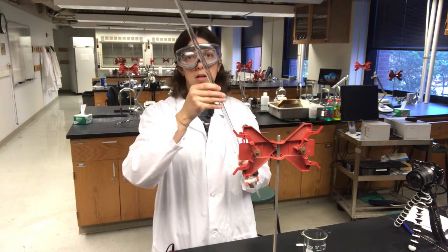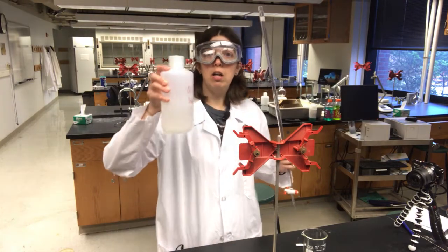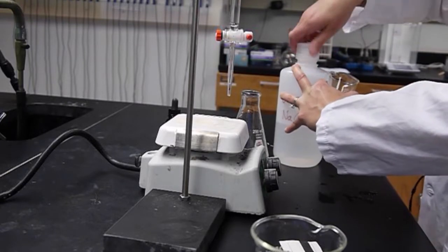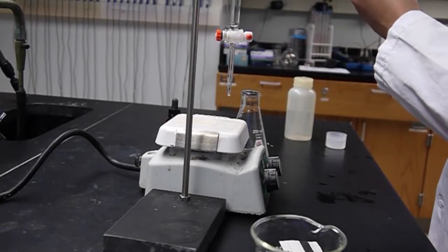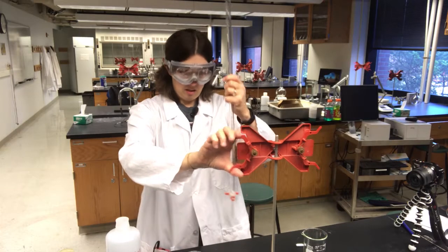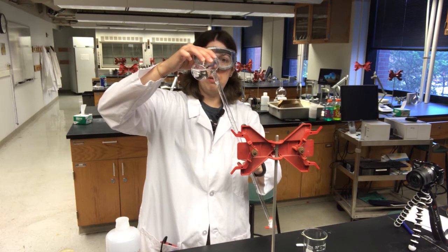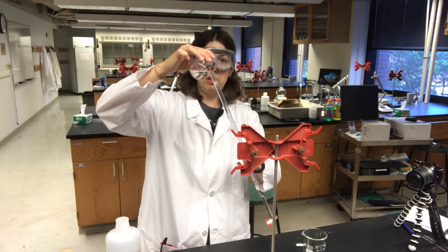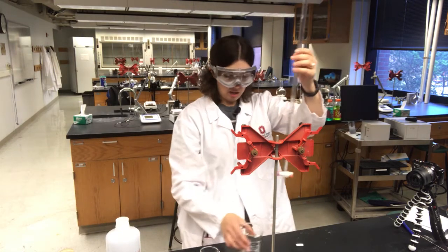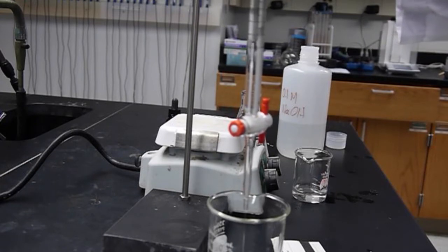Now I'm going to rinse out my burette. I've already rinsed this with water from my wash bottle, and now I'm going to rinse with sodium hydroxide. For today's titration we're going to use sodium hydroxide as the titrant. I'm adding a little bit of sodium hydroxide to the clean burette with the stopcock closed, and twirling the burette to make sure I get all of the walls washed down with sodium hydroxide.